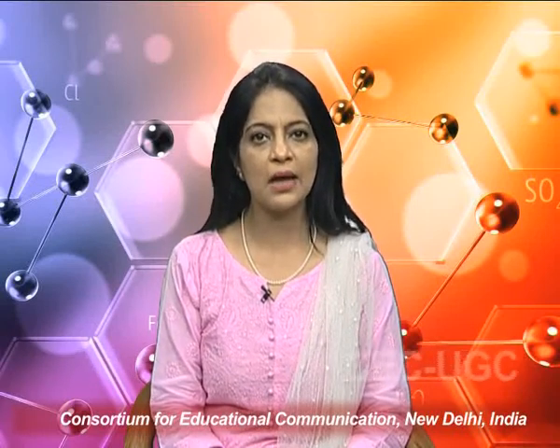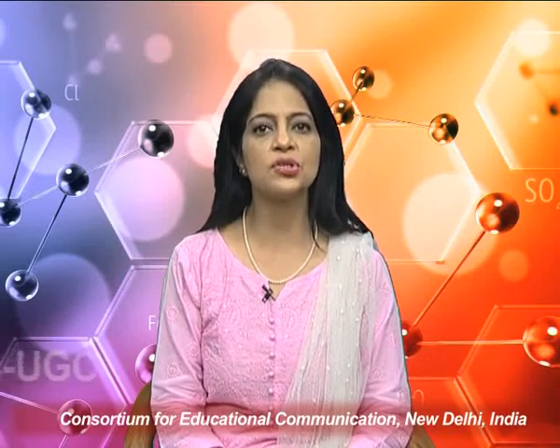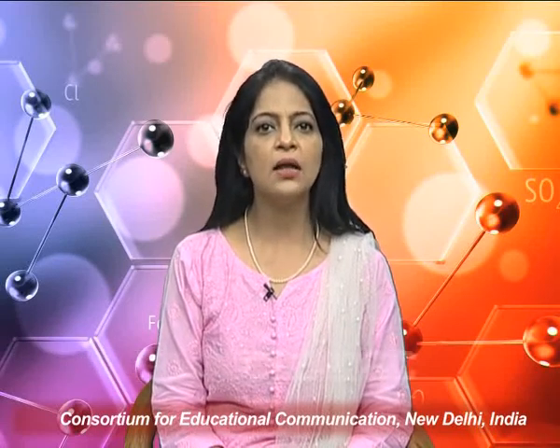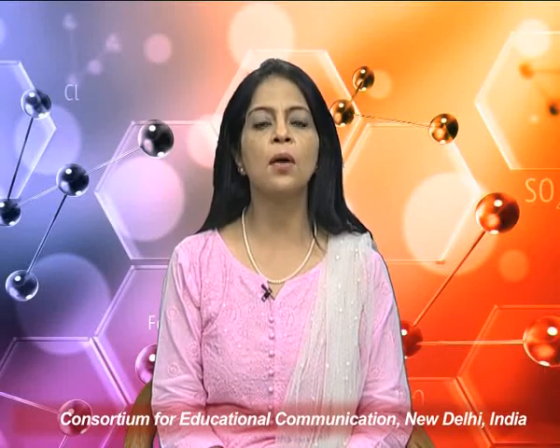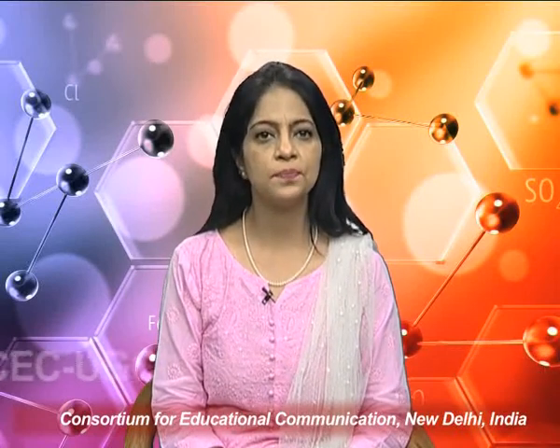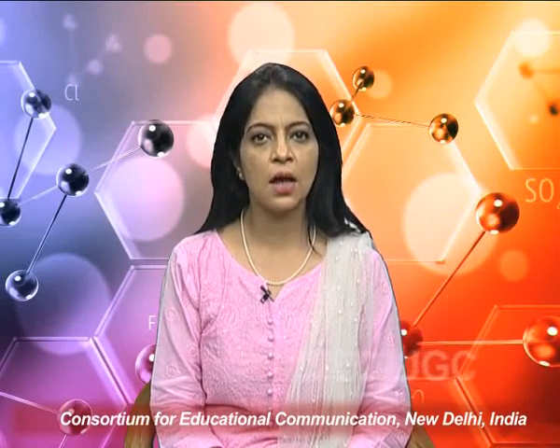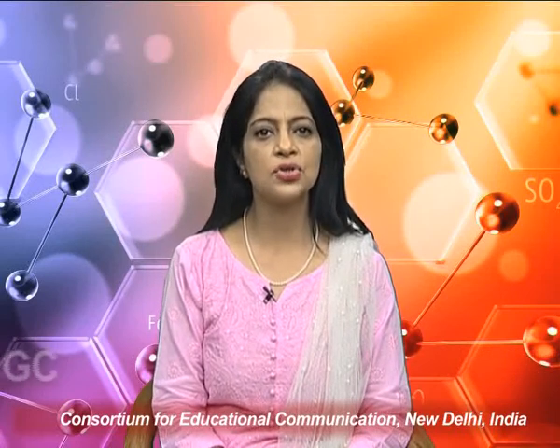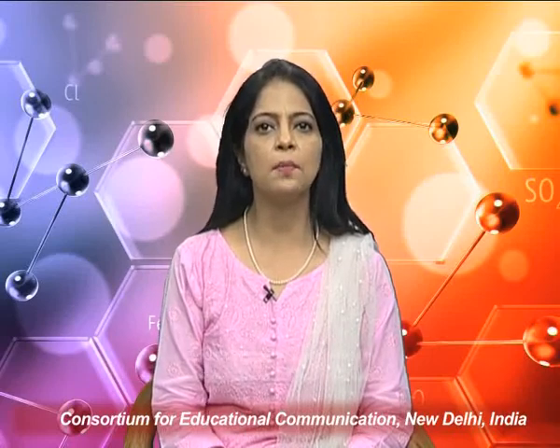That is, a metal ion solution is taken in the burette and the EDTA in the conical flask is titrated until the indicator changes from the free state to the metallized color. The amount of EDTA added in excess is to be taken into account in the calculations to determine the amount of the particular metal ion.